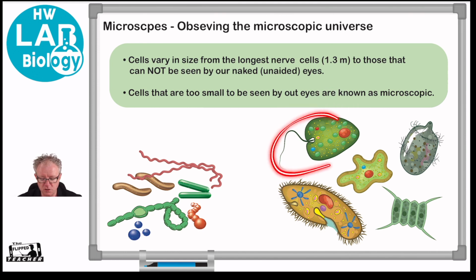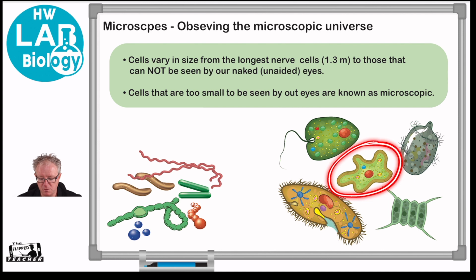This one here is called a euglena. We've got an amoeba here, which is like the blob, if you will. It has pseudopodia, we call it, where it can move, and it's really a cool organism there, right? And then we have bacteria over here, different types of bacteria. We had no idea about these guys.